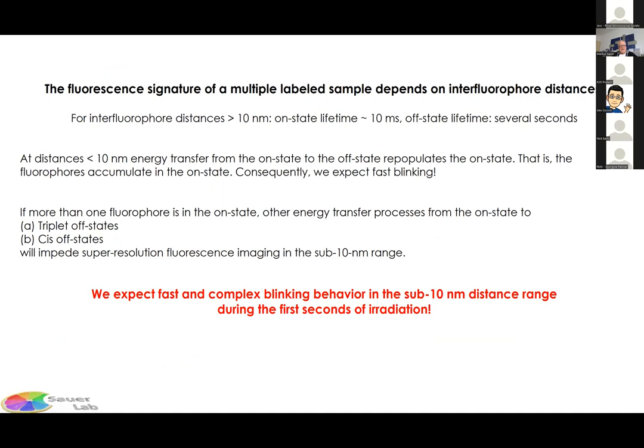For a single fluorophore, or for fluorophores with separation distances or interfluorophore distances of larger than 10 nanometers, you have typically on-state lifetimes in these dSTORM experiments of about 10 milliseconds and off-state lifetimes of several seconds. However, at distances shorter than 10 nanometers, a certain chance might come up that there is energy transfer between the on and the off states, and this then repopulates the on state. So we hypothesized that this should result in faster blinking of fluorophores, at least during the first few seconds.